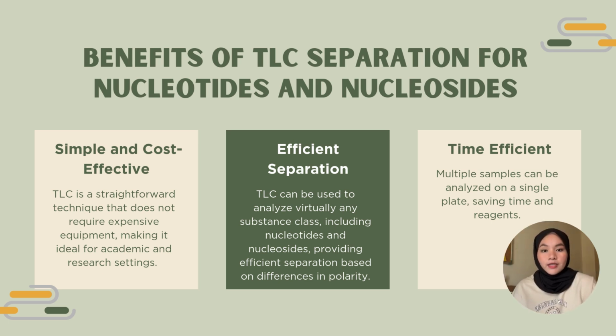Alright, and finally, the last benefit is time efficiency. Another advantage of TLC is that we can analyze multiple samples on a single plate, and this makes it a time-saving method as we can quickly process several compounds simultaneously, saving both time and reagents.